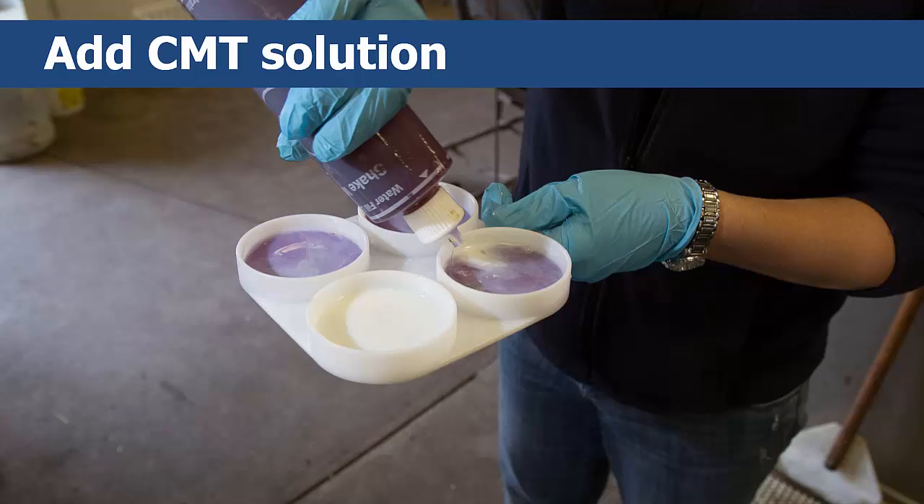Pour in an amount of the diluted CMT solution equal to the amount of milk already in each cup in the paddle. Once all four cups have the milk and solution mixture in them, gently swirl the CMT paddle in a circular motion to thoroughly mix the contents. You'll be able to see the reactions almost immediately.